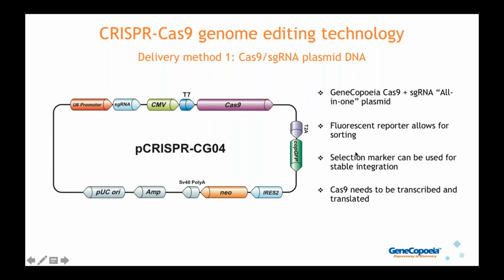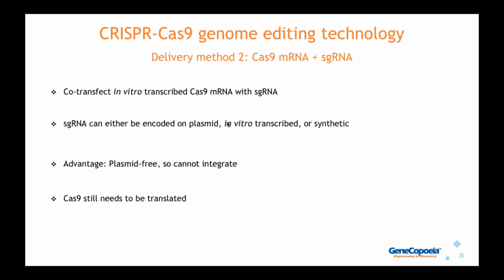The Cas9 and guide RNA still need to be transcribed. Cas9 needs to be translated. And also plasmids can integrate, which is sometimes okay, but isn't always desirable. So for that, there are alternative methods for Cas9 delivery that I'd like to talk about.